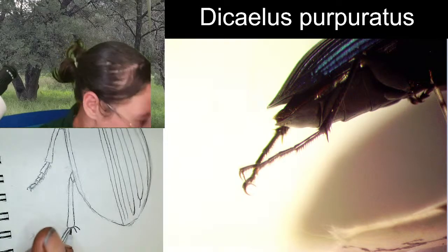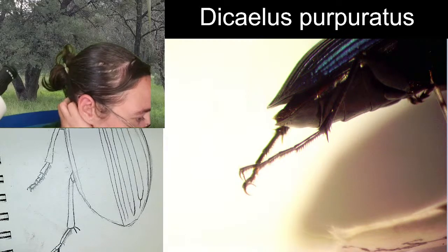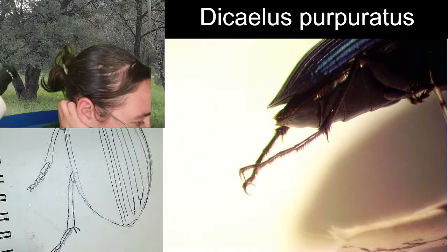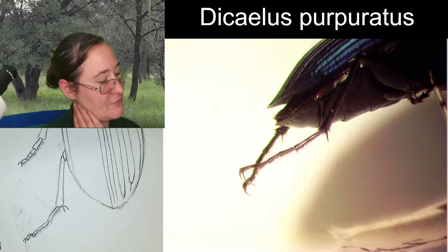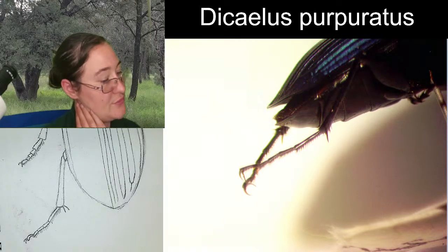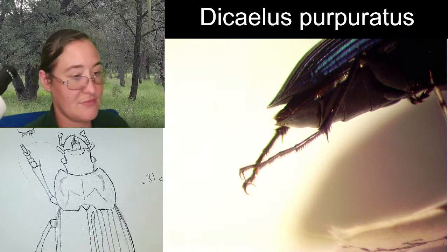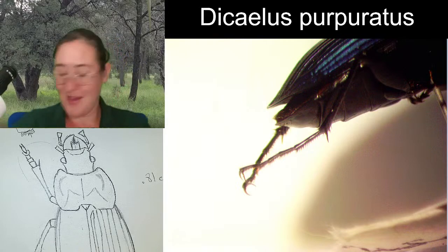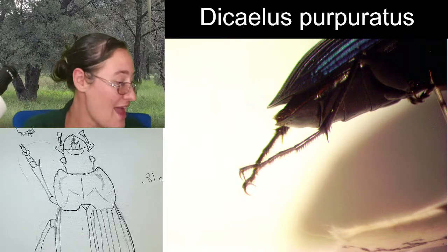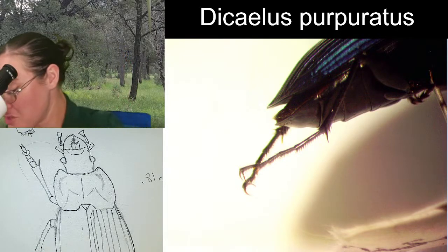Right, five segments, five tarsal segments, and then all of these bristles along the bottom. Okay. That doesn't look bad. He's pretty cute. Alright, so that is Dicaelus purpuratus. We got a lot of measurements on this specimen.